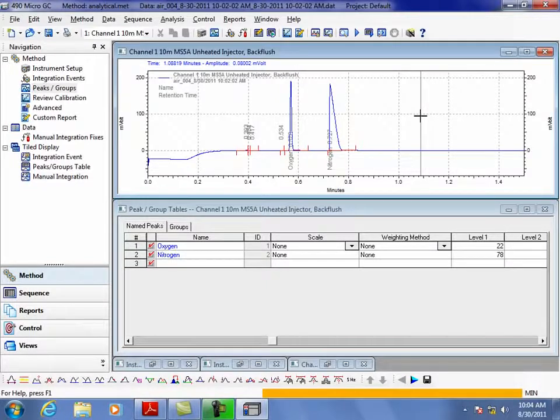I certainly couldn't use 100%. Well, somewhere about here, which is 1,000 ppm, should be what I'd expect my detection limit to be. It reproduces to 0.1%, so about 1,000 ppm. So don't do 100% of something and expect to get decent numbers down in the ppm range.